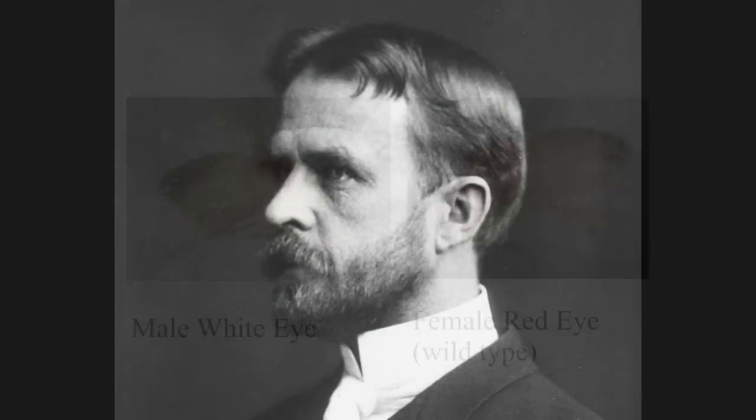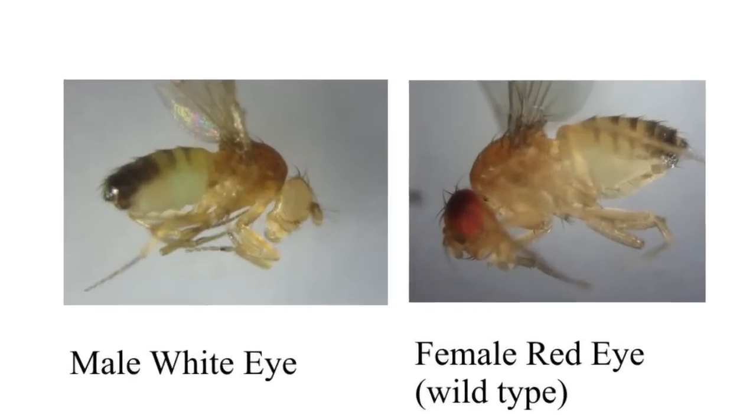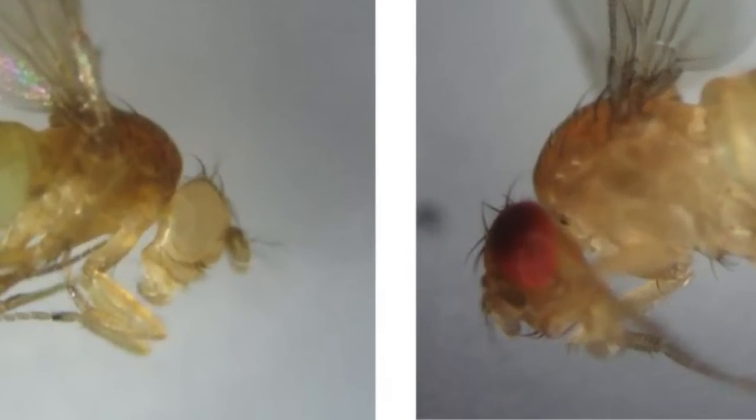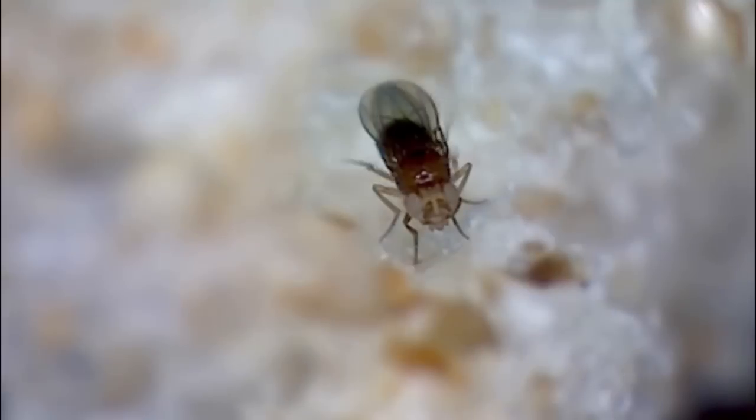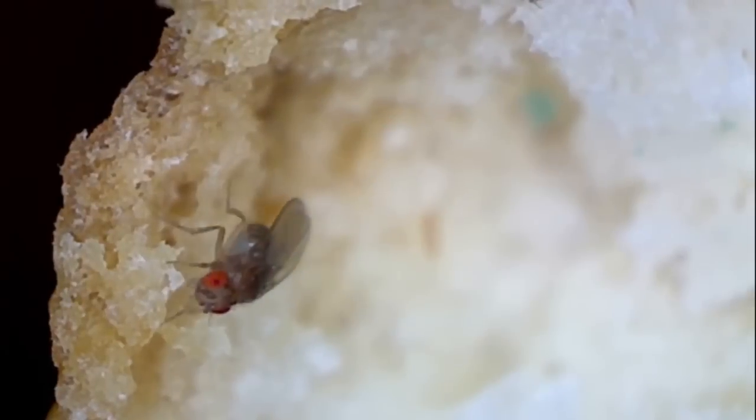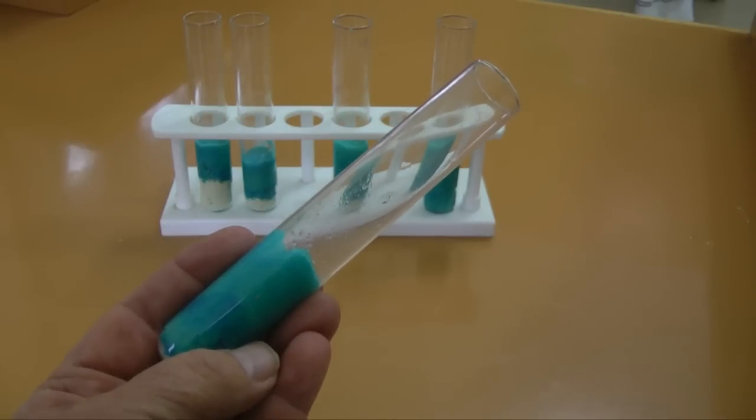This experiment we are replicating was first done in 1910 by research scientist T.H. Morgan. He mated a white-eyed male fly with a red-eyed female. The results were surprising. We need a male white-eyed fly and a virgin female red-eyed fly. The male fly is easy to find, but we need to isolate a female fly before she has a chance to mate.